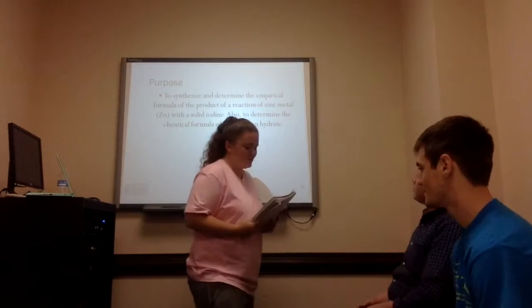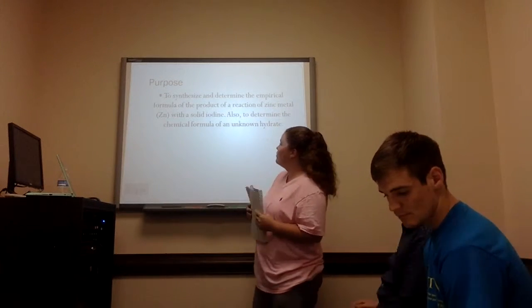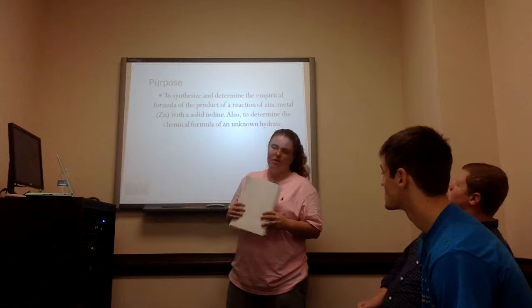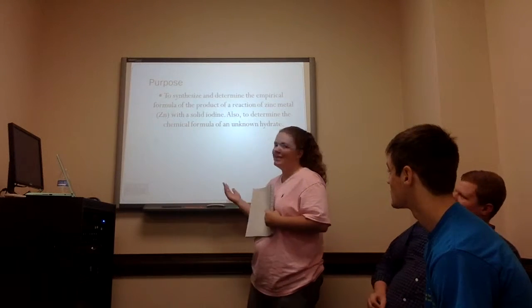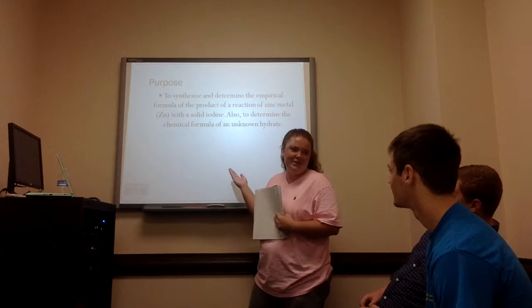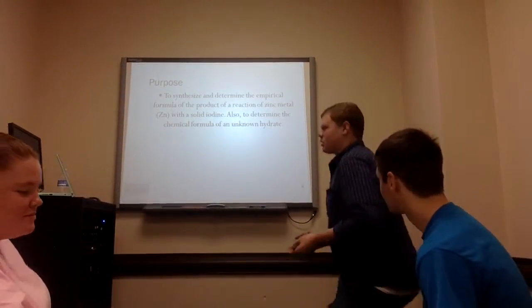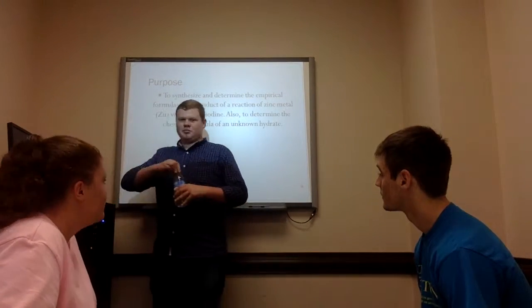So my purpose statement was that the purpose of this lab is to synthesize and determine the empirical formula of the product of the reaction of zinc metal with solid iodine, to determine the formula of an unknown hydrate. So basically, what we're going to do is mix some zinc with some other stuff to find the unknown hydrate. Very good. Thank you. So, that is the purpose of this lab.